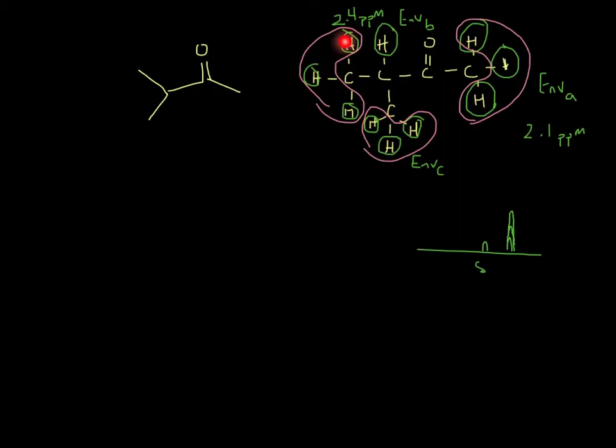They, of course, don't know each other. They don't look at each other and say, hey, you are the same as me. But they are the exact same distance from the exact same identity molecules. So they're all CH3s next to the same CH, next to the same carbonyl, next to the same CH3. Therefore, while these two CH3s are identical to each other, they're not the same as this one off to the right. Now, how many hydrogens are going to be in this environment C?